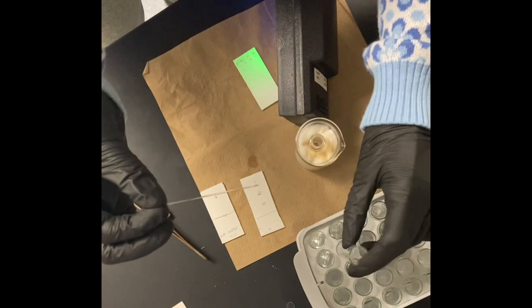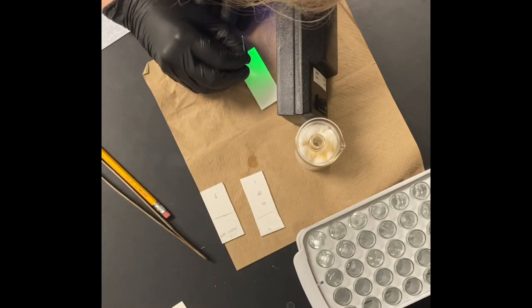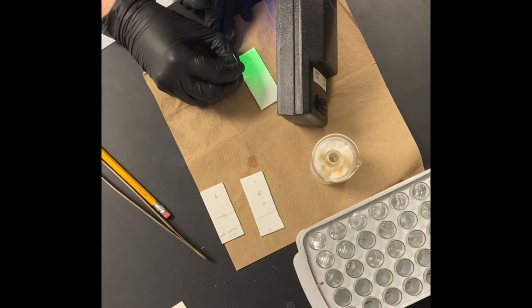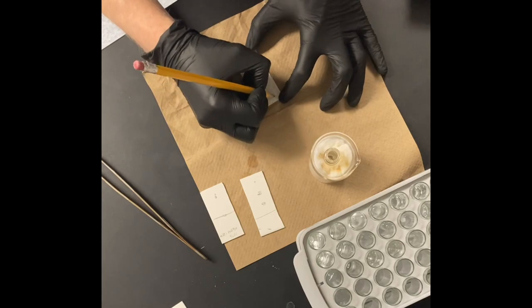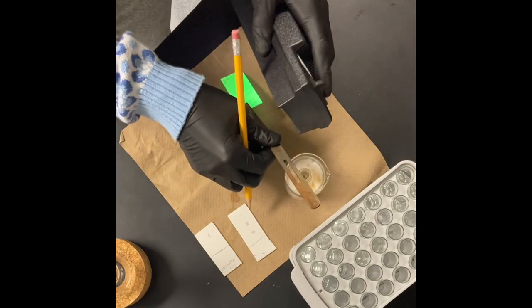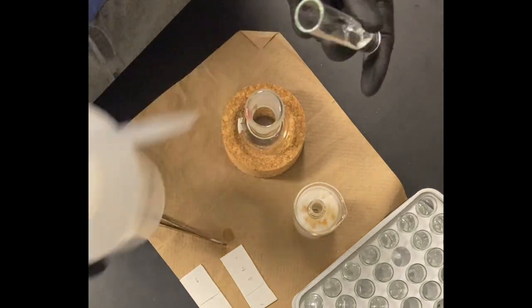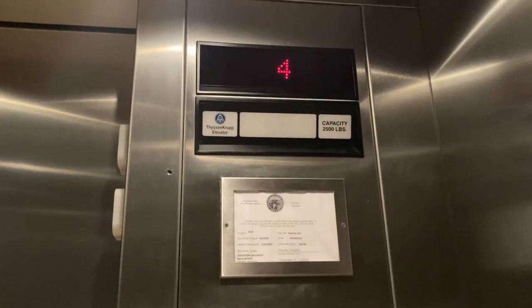Hopefully you'll obtain either an oil or a powder. In our lab, we really like to get white powders — white indicates they're pure, and powders are a lot easier to deal with than oils. Oils can be a pain, especially for removing them from flasks or weighing them out. I developed the TLC plate in a solution of 20% ethyl acetate to hexane, checking with a UV light to see where the spots are. They all lined up, so I was able to collect all the same fractions, rinsing them out with ethyl acetate to make sure I have everything.